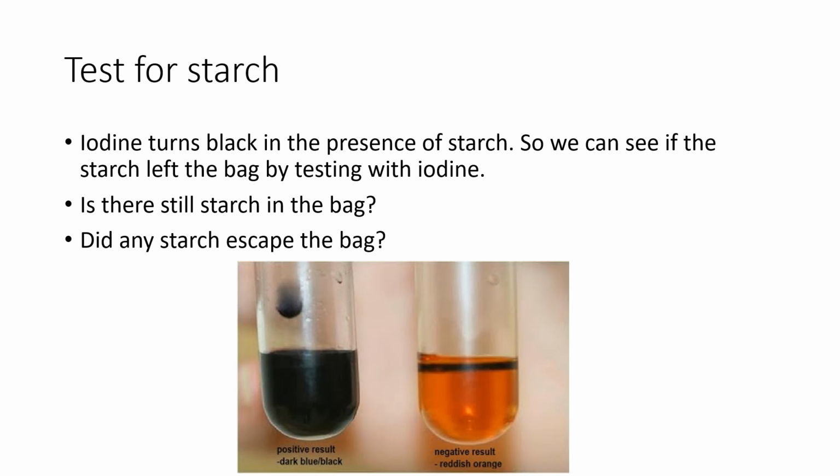What is the test? It's negative. The starch could not leave the bag. Then it says to cut open the bag and pour the starch contents into test tube 2. This is the result right here. So yes, the starch is in the bag.